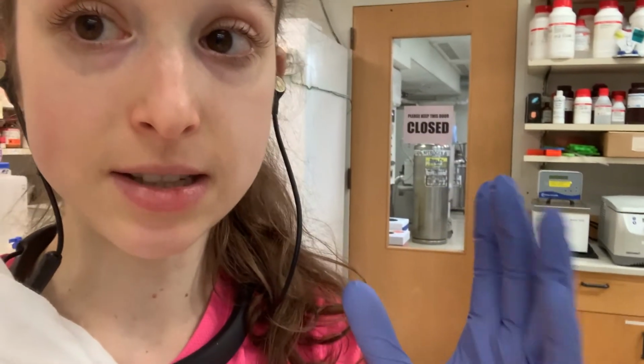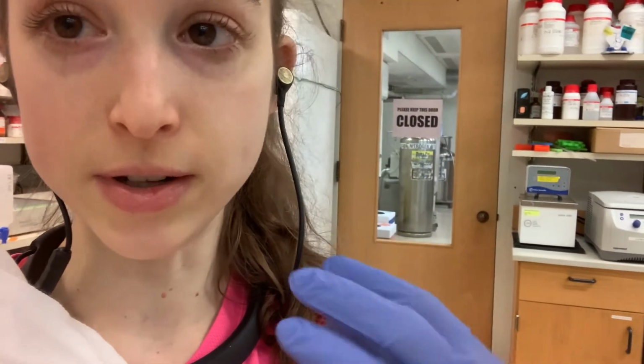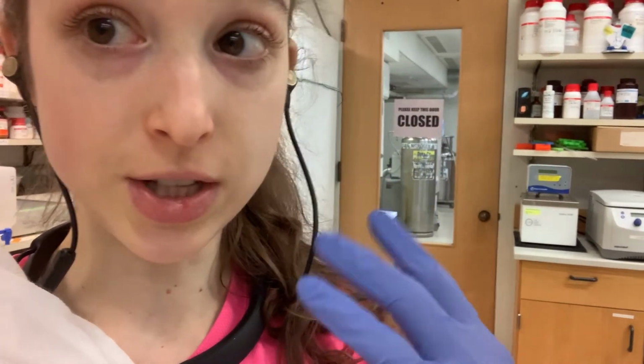When you're adjusting the pH, it's important to note that you want to adjust the pH at the temperature that you're going to use it. For some buffers, especially tris, this can be a really important thing, because the pH is actually going to change when you change the temperature.